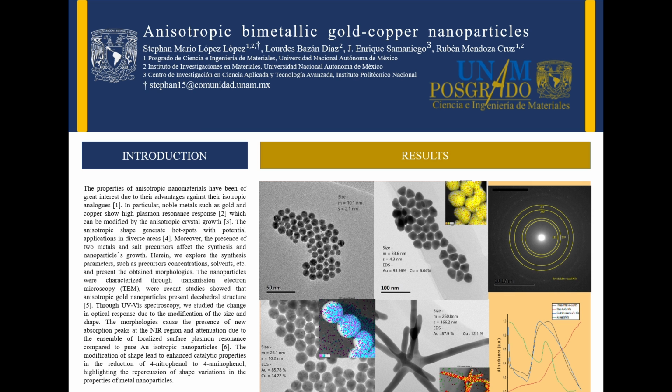Moreover, the presence of two metals and salt precursors affects the synthesis as the nanoparticles grow. The morphologies were characterized through transmission electron microscopy, and the chemical composition was characterized through electron dispersive spectroscopy.